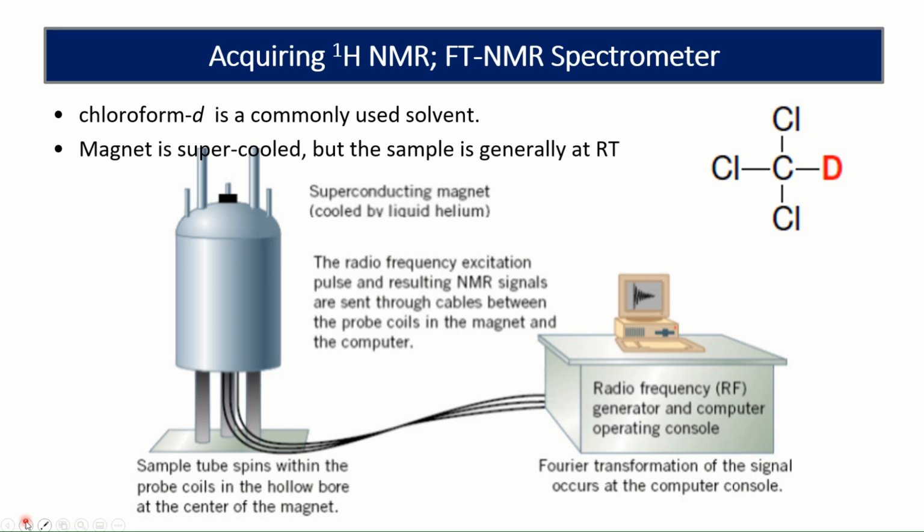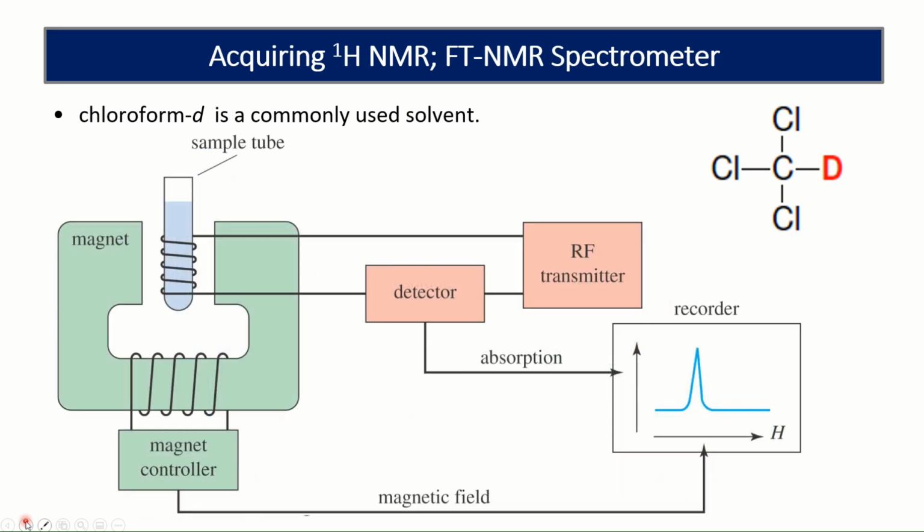And then inside this huge instrument, we have a small sample, yet spinning so as to create some sort of homogeneous field.